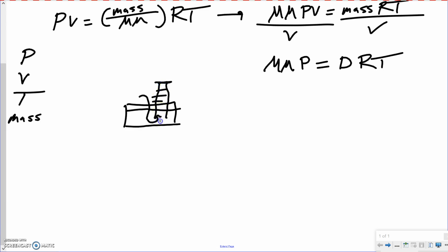So once you put the lighter underneath here, you're going to click it, and what's going to happen is gas bubbles are going to form, and those gas bubbles are going to move all the way up into our graduated cylinder, and it's going to displace the water in the graduated cylinder. What that's going to allow us to do is measure the amount of gas in the graduated cylinder via volume. So this gives us the volume of the gas.